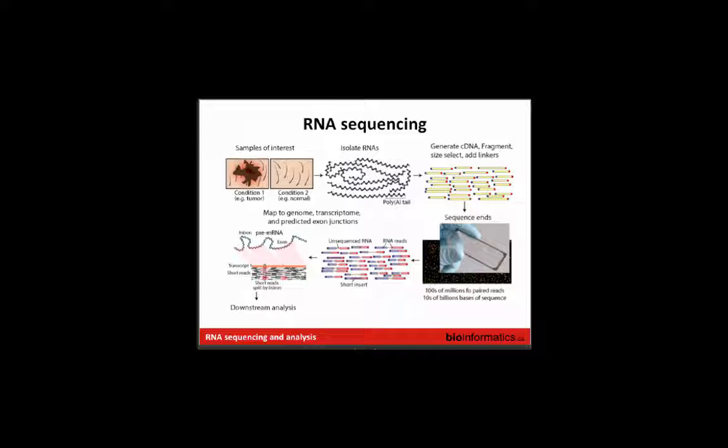And some people are actually taking it further and having a really small RNA-seq, like the microRNA libraries, and then a medium RNA-seq library strategy that's in the 50 or 75 to 150 range, so the small, medium, and large strategy. And I think that's still an area that's being experimented with, like whether you need to do that.